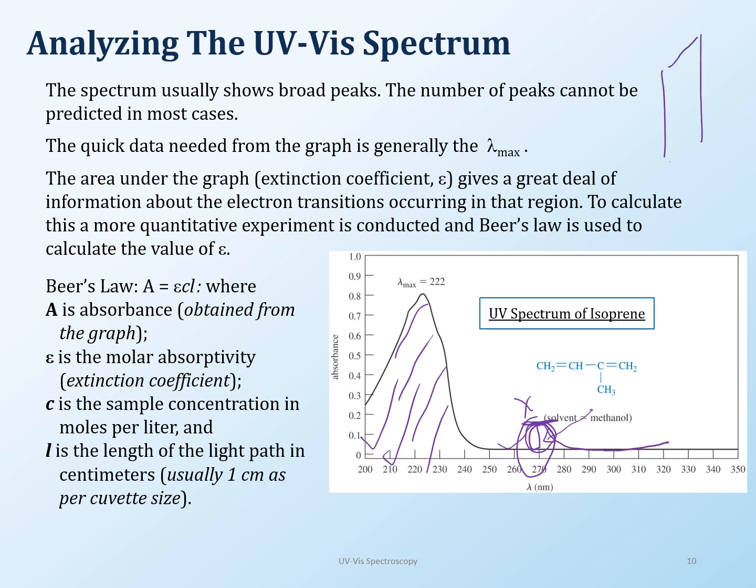when you have a cuvette, for example, something like this, the length of the light that's passing through that cuvette is an important thing. So this is 1 centimeter usually. That's how cuvettes are made. That's why I showed you the sample holder, that it's a cuvette. What I didn't mention is it's 1 centimeter. It's a very specific length. So even in the UV-Vis, the actual sample holder is made specifically to accommodate this cuvette. The length of the light going through is really important.